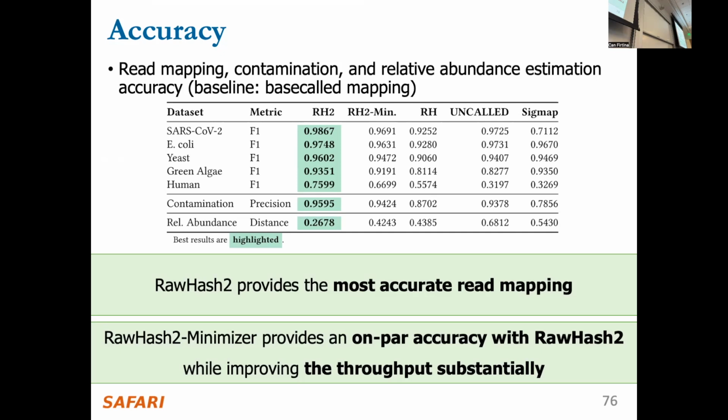So the signal change is a simple statistical t-test, also known as Student's t-test. You have maybe two windows, maybe you could have a single window as well, and then you continuously check whether a particular point is significantly different. That's the approach that we're taking, but it's not perfect. Maybe some ML approaches could also be used there.